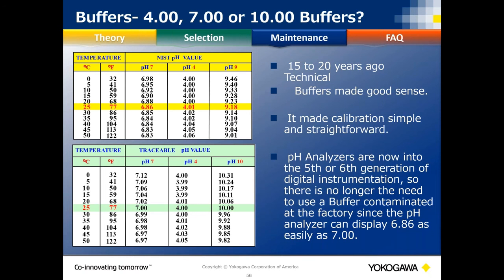6 and 7 are pretty stable. They don't have too huge of a swing over temperature swing, because remember, it's sensitive to temperature. 4, 4.01, that is the most rock solid one with temperature across any of them, and it has the least amount of additives added to it. So we want you to start with a 7 and then do a 4.